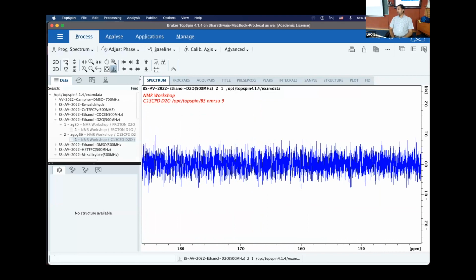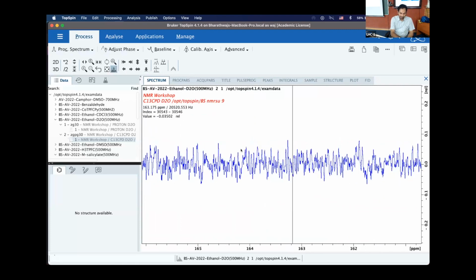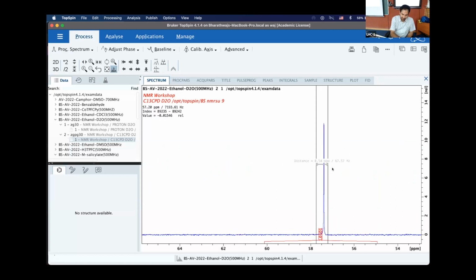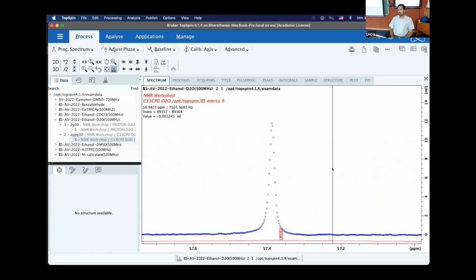This is what we mean by noise. If you end up taking the average, the noise would still go to zero, indicating that it's just stochastic. On average, it's not existing. But at any given point in time, you have some randomness present. Randomness being, you will never be able to see anything periodic with respect to this. So if you keep repeating your experiments, noise will be random enough that when you add, it won't grow. On the other hand, signal will nicely grow only wherever there is a frequency. So this will keep on growing, correct? So if you do signal averaging, you can improve the sensitivity of the experiment. Does that make sense? This is what we saw yesterday as the signal to noise ratio.